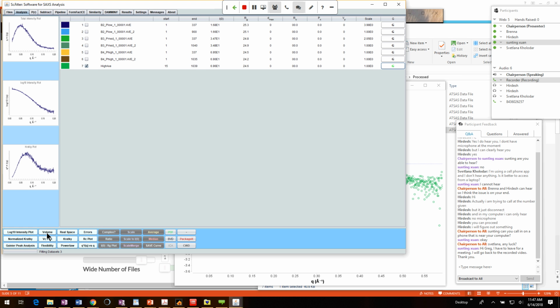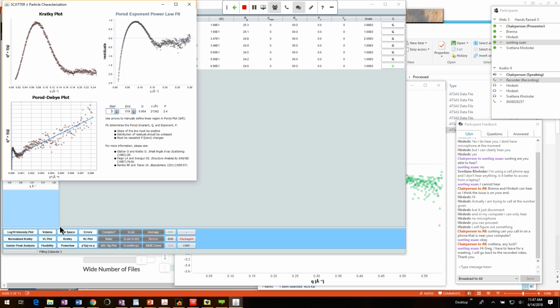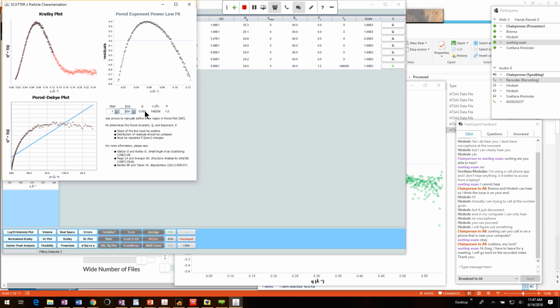So in ScÅtter, I will hit Volume here. The region that I want to focus on to extract the volume of the particle is right after the first bump in the Kratky plot, sort of this slant. I want to fit that region with an exponential of some sort. Okay, so I'm going to drop the number of points here. Let's say 200. You can see part of the curve turned red. That's the last point. So I'm just going to, again, focus in here.